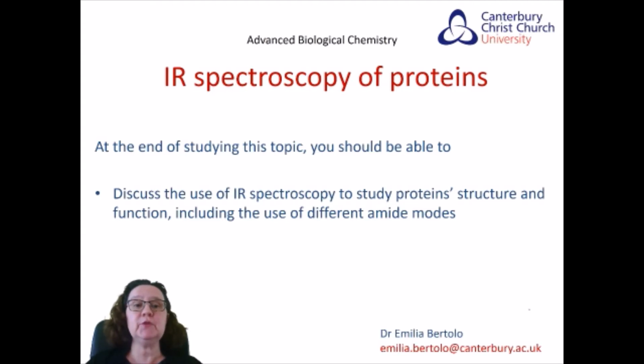The aim of this video is to give you an overview of the use of infrared spectroscopy to study proteins, both structural studies and also functional studies. And we will also be looking at the use of the different amide bonds in the infrared spectra to perform those studies.